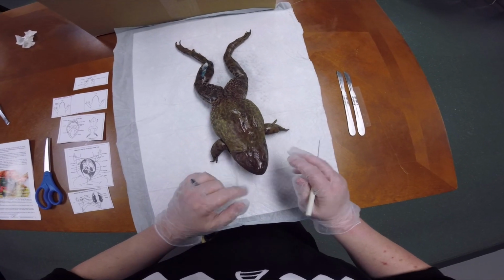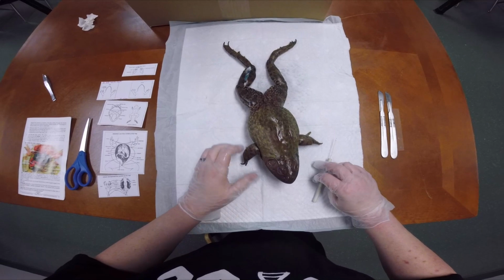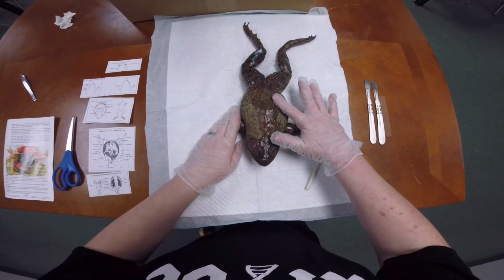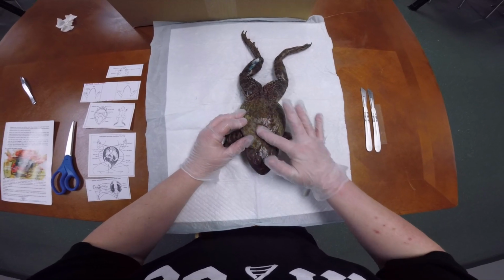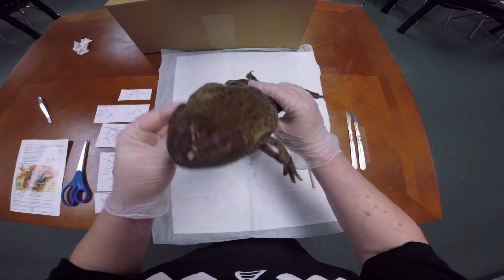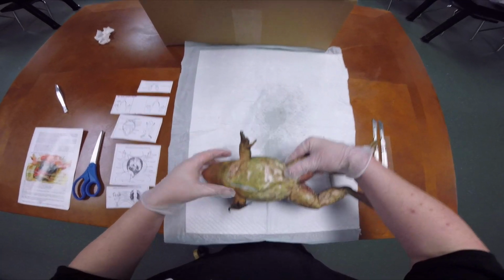They have two eyes, two external nares, and they have their mouth. So this is the top part. You can see the brown and the green, which helps him, her, to be camouflaged in the wild.